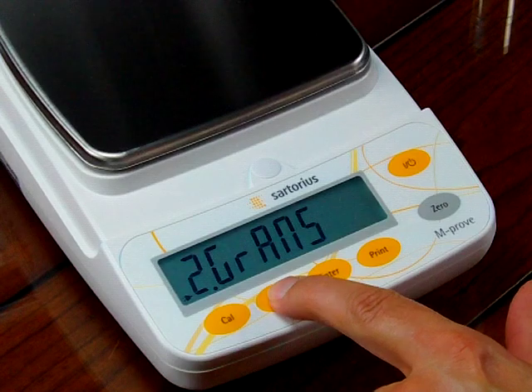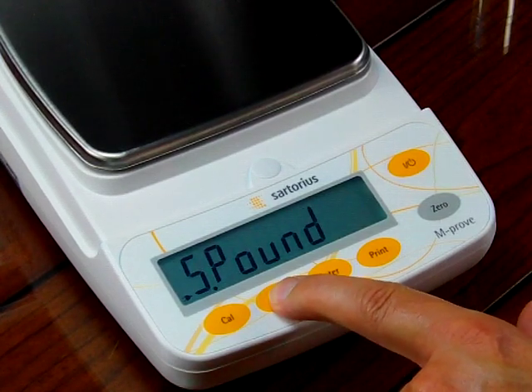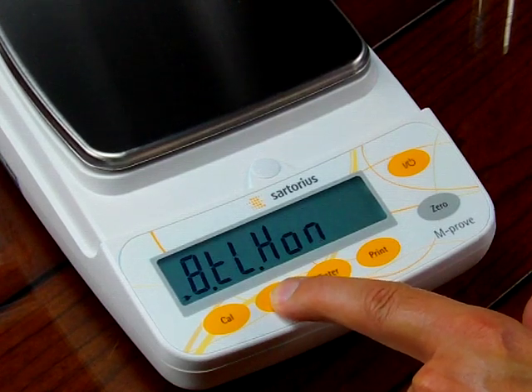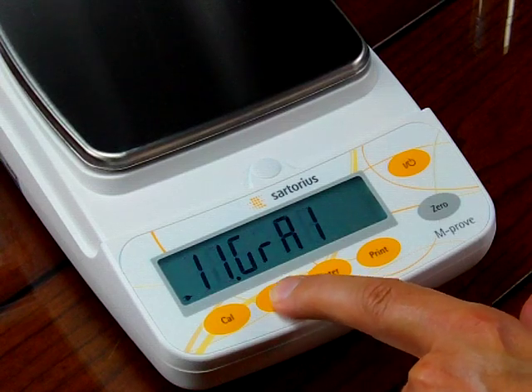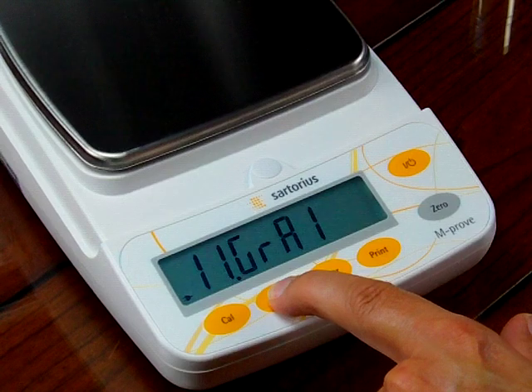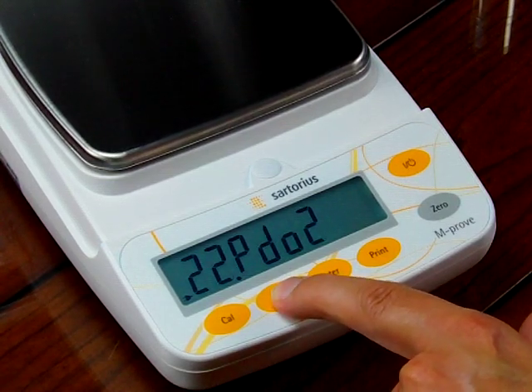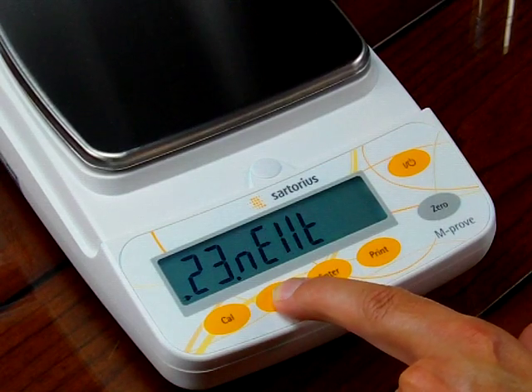Now we've entered the unit application. This first option is grams. We can change this by pressing the F key: carats, pounds, ounces, troy ounces. Then there are several teal units used in regions like India. Then grains, penny weight, more teal variants, pound-colon ounces, and newtons.